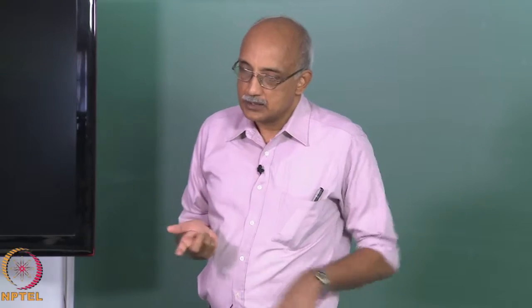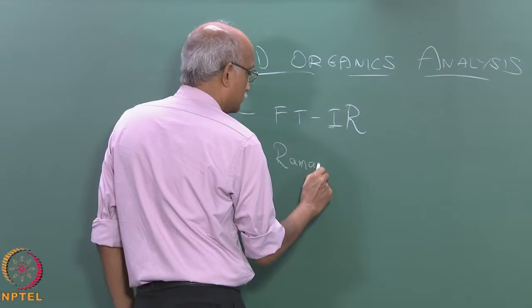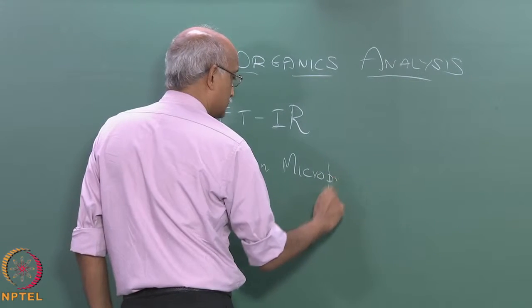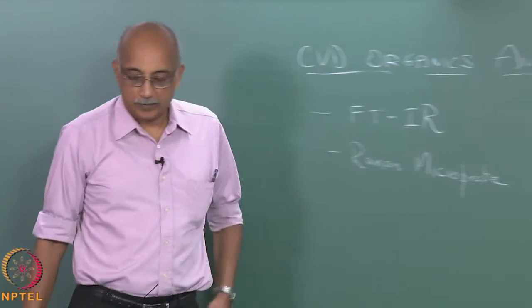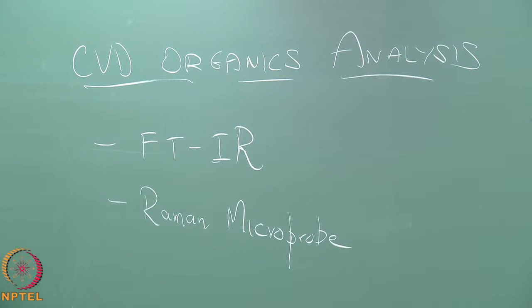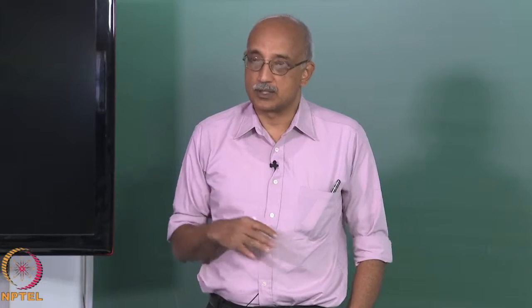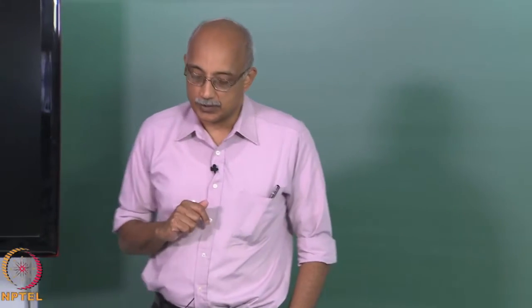So the technique that is frequently employed is something called Raman microprobe, which actually can reduce your resolution or your lower limit of detection to a micron. It actually can be used both for organic as well as inorganic materials. So it's a little more flexible in terms of its applicability.